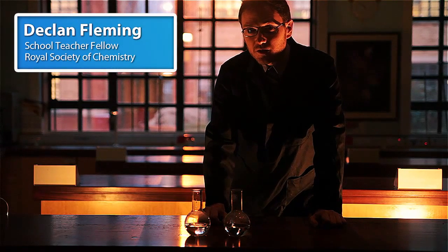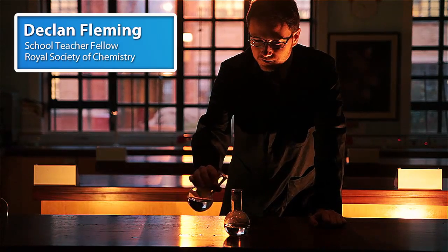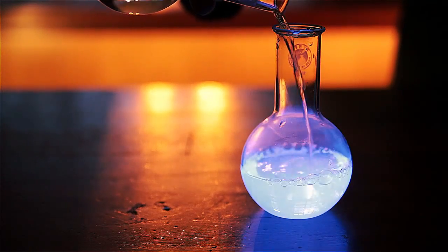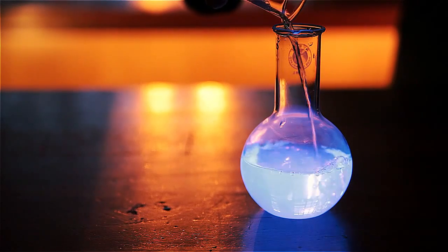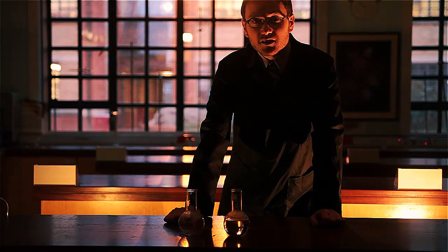The cold light produced by the oxidation of luminol has been a popular demonstration for years. But there are even more dramatic ways that we can display this really interesting experiment.